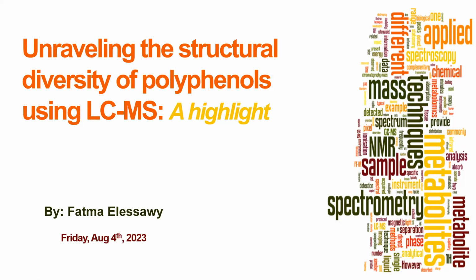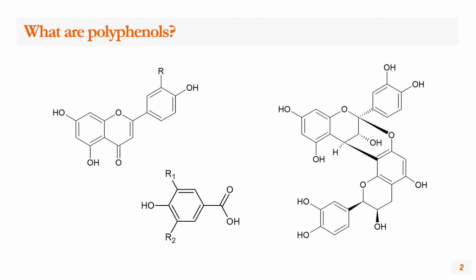Hello, everyone. I'm here today to talk about a part of the work that I did in my PhD, but I will not go into the details. I just wanted to mention a highlight that was interesting for me. I hope it's interesting for you as well. So I'm talking today about polyphenols and how their diverse structures can be distinguished using the LCMS.